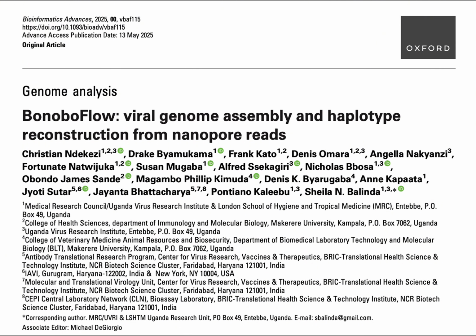And adding to that challenge, there was a real lack of standardized, end-to-end pipelines specifically designed for ONT data. So researchers had to kind of patch things together. Pretty much. They had to find different tools for each step, from base calling, which is translating the raw signal into DNA letters, all the way through error correction, assembly. It wasn't streamlined. This sounds like a bottleneck. It was a major limiting factor for integrating this really promising technology into routine research and clinical work.